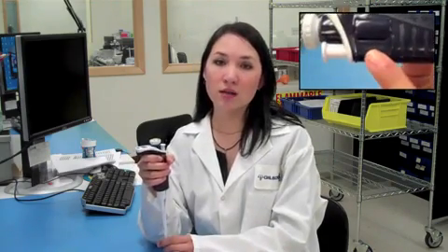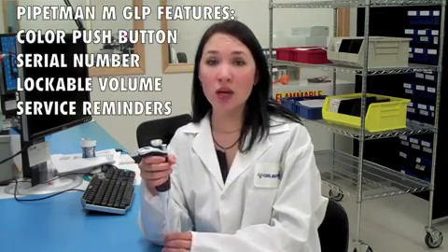The Pipetman M also has many GLP features. It has a color-coded push button that makes it easy to identify the pipette and match it with the appropriate size tips. It has a serial number, so you can match the pipette with the box, and it's fully traceable back to the manufacturer. You can lock the volume of the pipette.